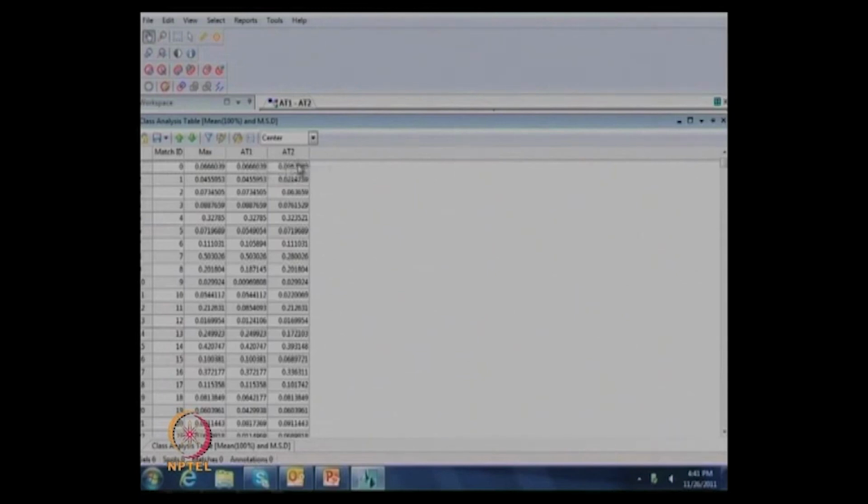Okay, so for the control and treatment, both groups we had 6 gels, right? Yes. So what are the values in each of the 6 gels for each spot? For each spot, exactly. This is the averaged value again, the average of all the 3 gels from each group. Ratio value, if you can see, this is the ratio value which is giving the upregulation or downregulation.